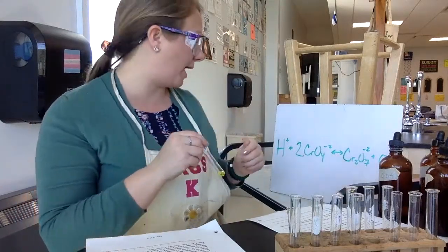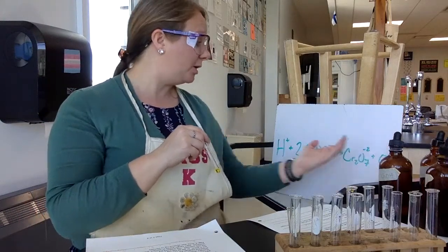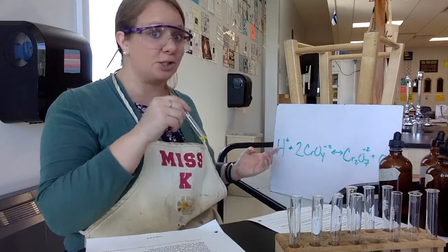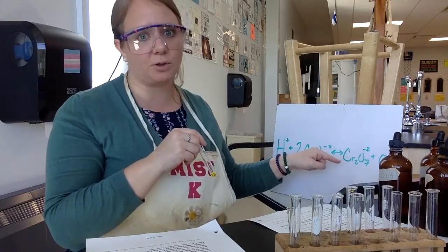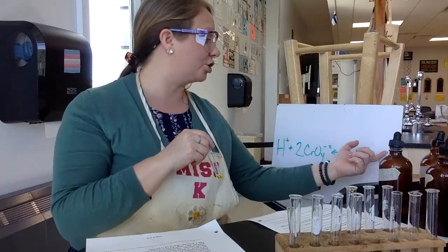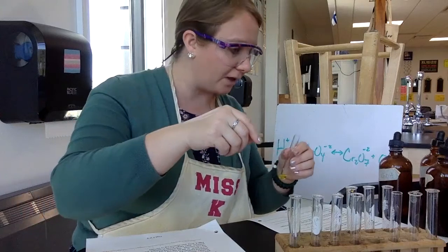We've done this before, right? CrO4, add OH, so that means you're pushing the equilibrium to the reactant side. The goal is we have little to no Cr2O7 left, a really small amount, because you're forcing the shift to the CrO4 side. So go ahead and fill in that blank.